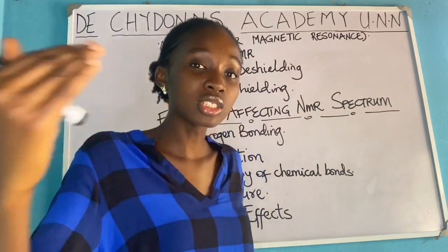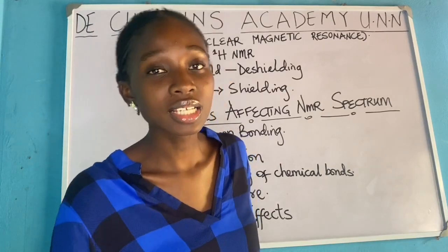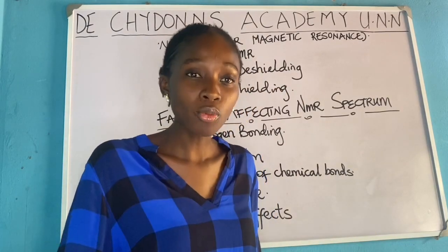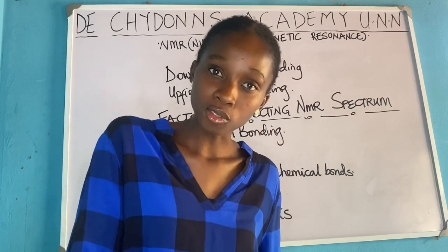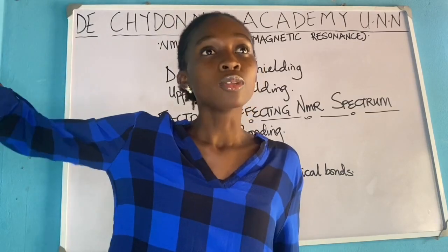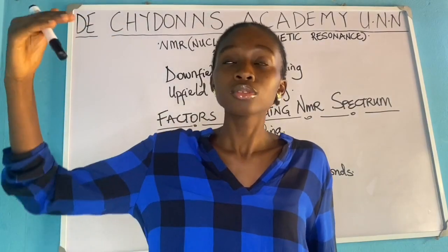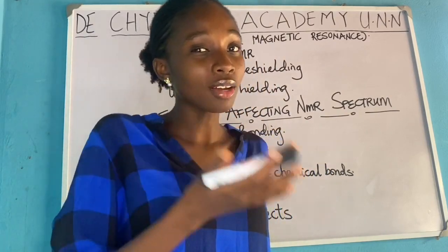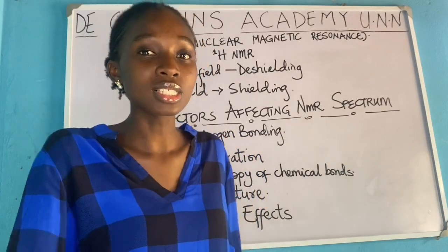Normally, values are supposed to go in a downward arrangement, like 10, 9, 8, 7. But in NMR, you go upward. So that's a paradox. In NMR, when something is downfield, it is deshielded, and when something is deshielded, it goes downfield. But in going downfield, the numerical parameter given to it is an increasing one. Should you get this? If something is downfield, it will be going towards 11, 12, 13 on the NMR scale. Even though the word downfield suggests going down, the numerical value you are giving it is high.